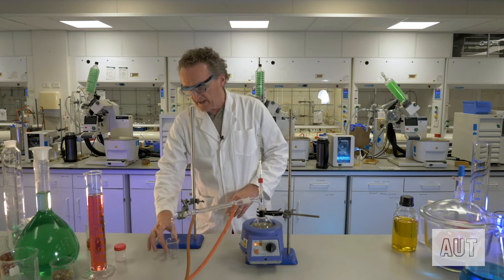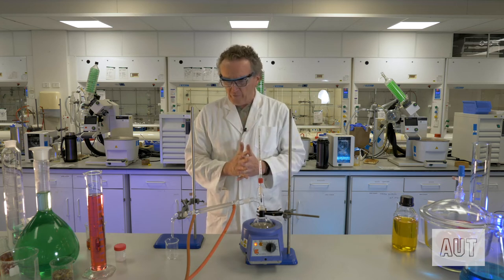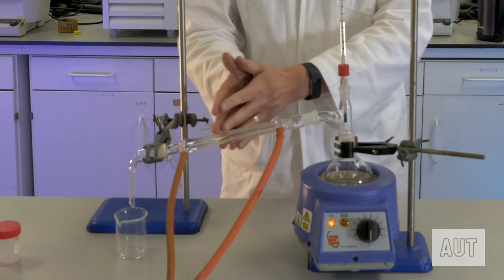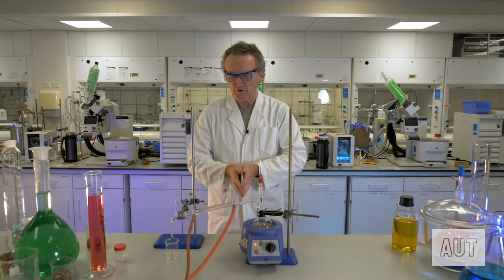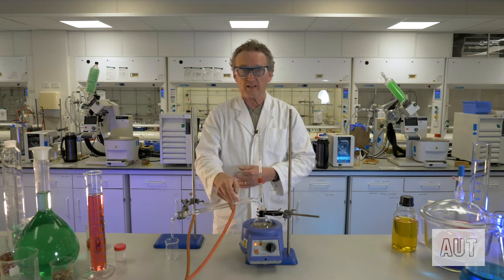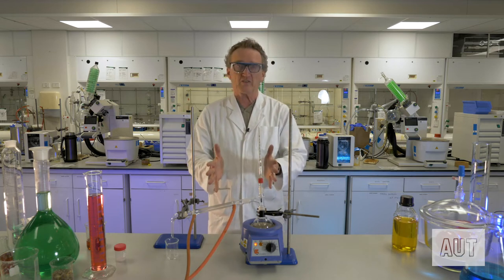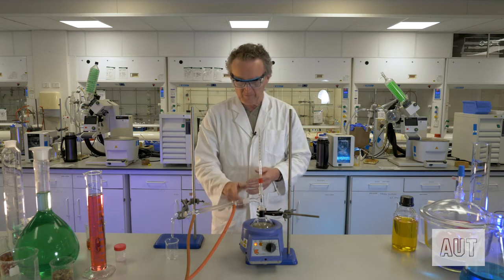So there is our beaker that we're going to collect our material in. Okay, so we're pretty much all set up. The one thing I haven't mentioned is the condenser. As I say, this has a continuous flow of cold water in it. The rule for condensers is in the bottom, out the top. So you always attach the tap to the lower end of the condenser. The cold water is coming in the bottom of the condenser, flowing up this way and out of the top, okay? So always remember that whenever you're using a condenser, be it in a simple reflux or, as in this case, a distillation, make sure it's in the bottom, out the top.